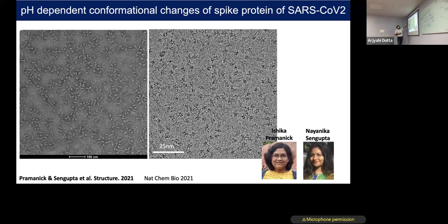And here you can see this is very nice data of negative staining. We can see individual protein molecules, and then this is the cryo image. There is one difference. Can I ask one question? Both are collected in cryo temperature and room temperature. In one case the same sample is appearing white, and in the other case it is appearing black. The protein molecules in cryo, why?